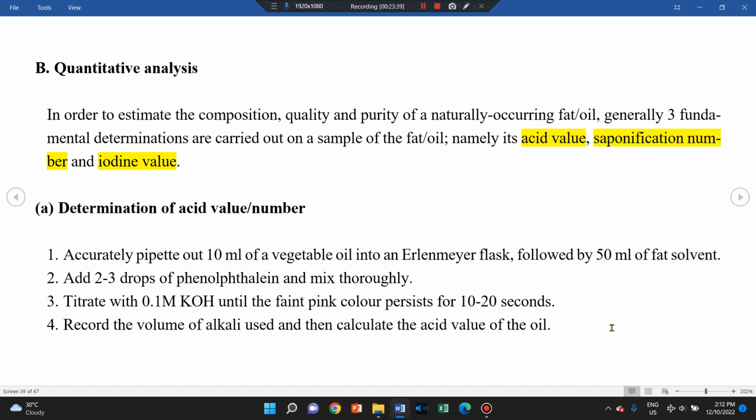And then the saponification number, usually they do it in the factory that makes soap. It's looking into the connection onto the carboxylic group, the hydrocarbon chain, or the group other than the carboxylic group, whereby if it's longer, the theory is the saponification number will be smaller, and if it's shorter, the saponification number will be bigger.